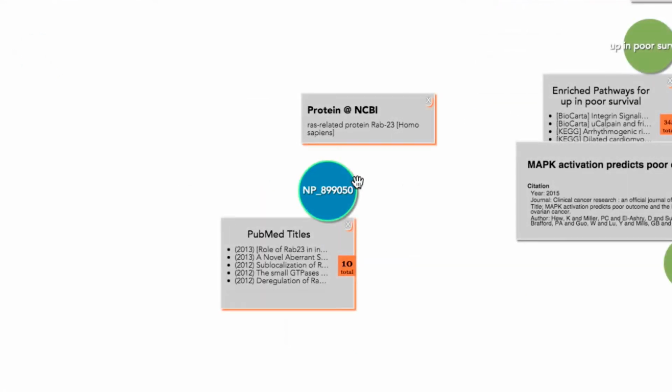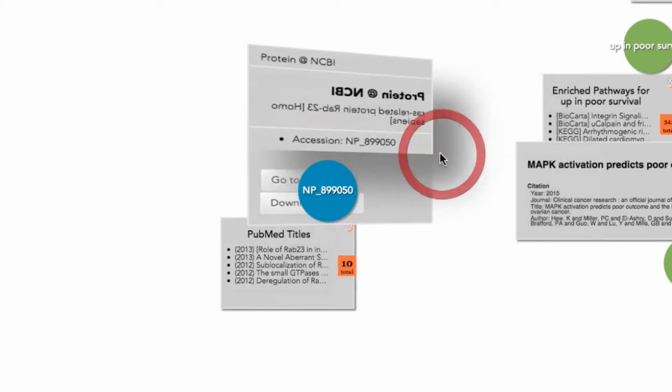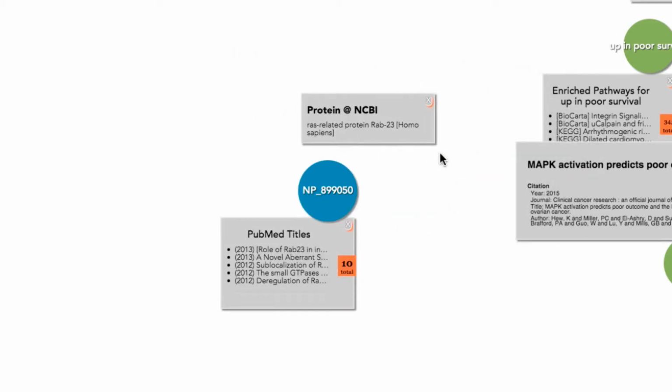Recommendations gather information from external data sources for users and are created by a proactive search and updated anytime you view the canvas. The front of the recommendation card has a brief description. Flip it over to the back side that contains more information and a link to the external data. Click anywhere on the back of the card to flip it back over.